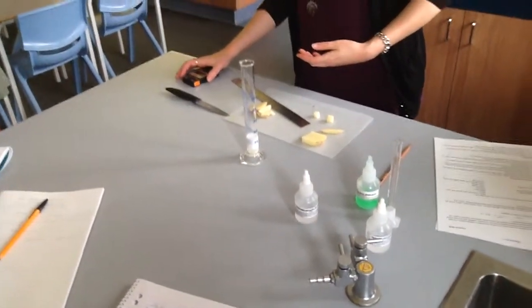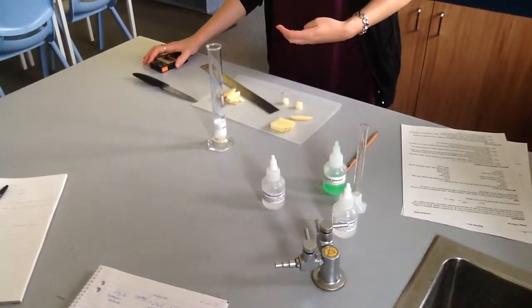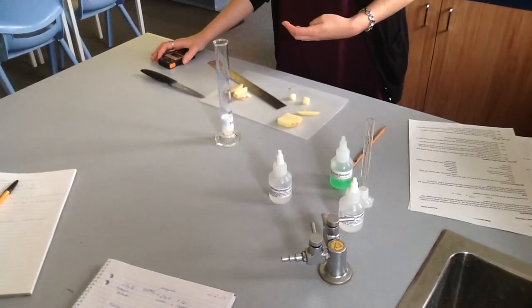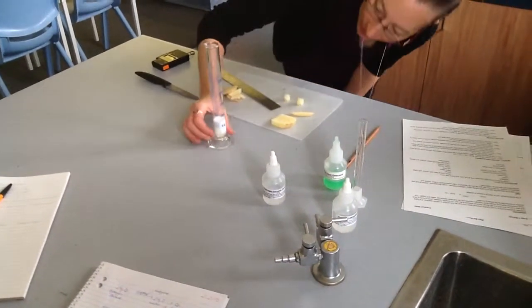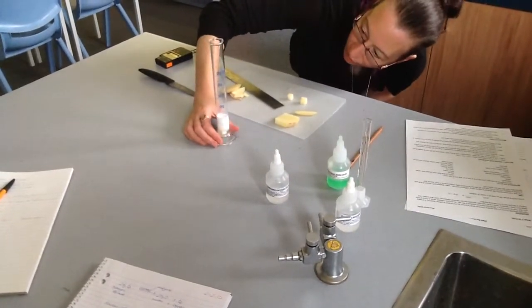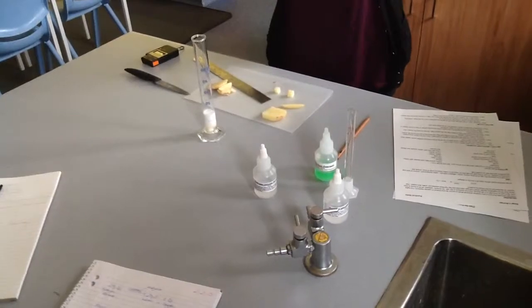All right, I'm getting close to my 2-minute mark here. All right, and so I look down, I read the volume. For me, the volume has read off at 14 mils, minus 10, so I produced 4 mils of foam. All right, so that's the foam method. You can probably stop that there.